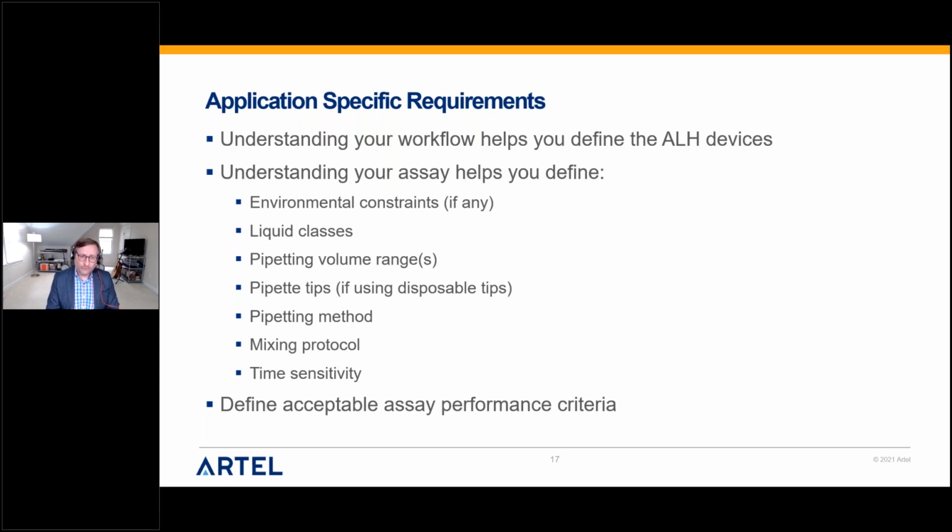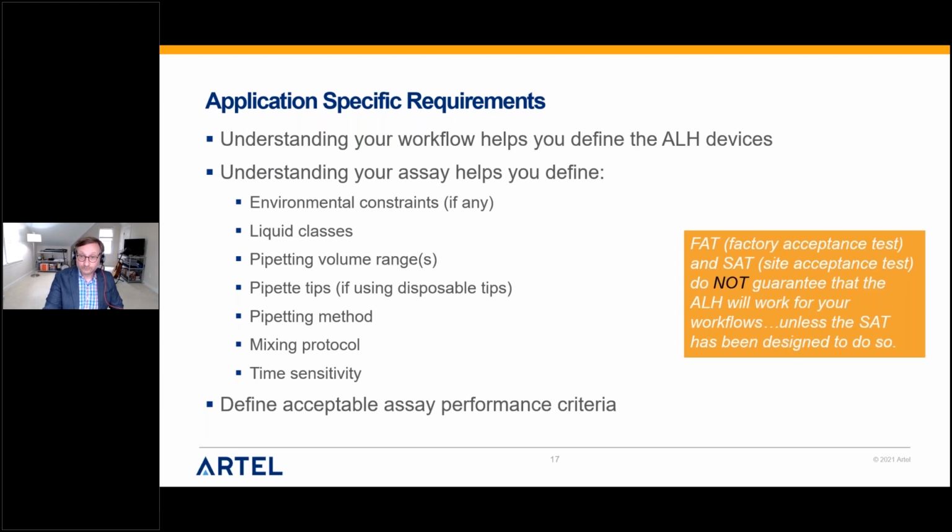And then also, don't forget to define what's acceptable to you for your assay performance. A lot of times people forget about this and they'll get all this other stuff, and then they come to realize, like, well, I have very demanding assay performance criteria. I'll never be able to meet it with this particular liquid handler, but by then it's too late. So, think about this ahead of time and try to come up with your specifications ahead of time.